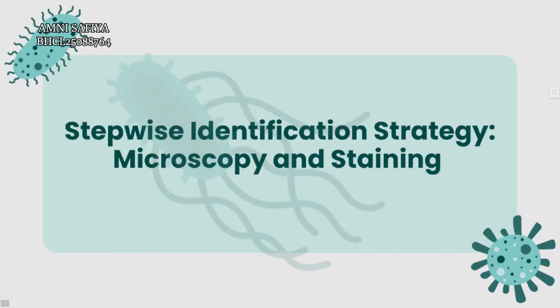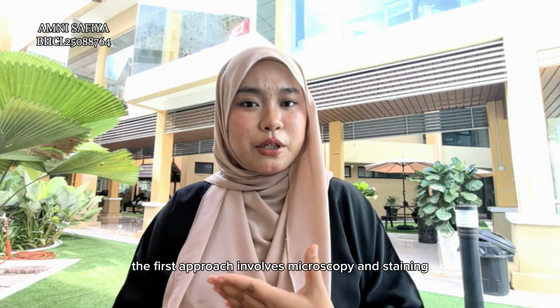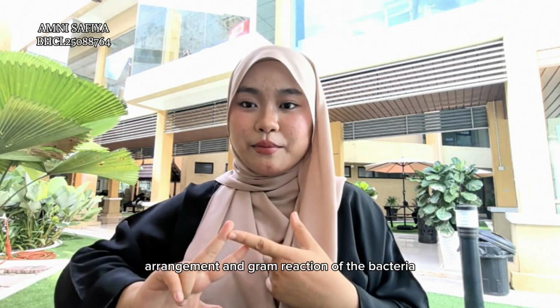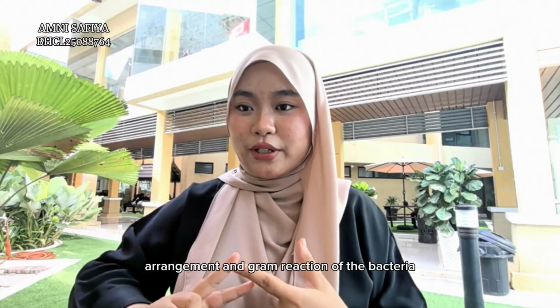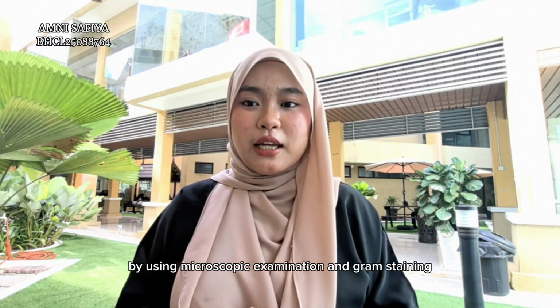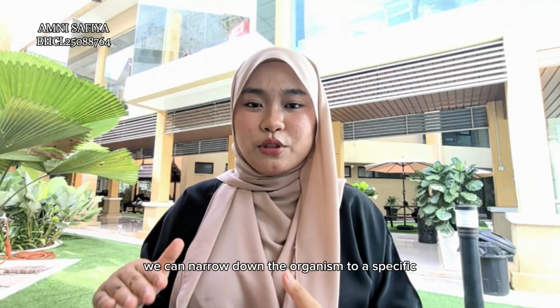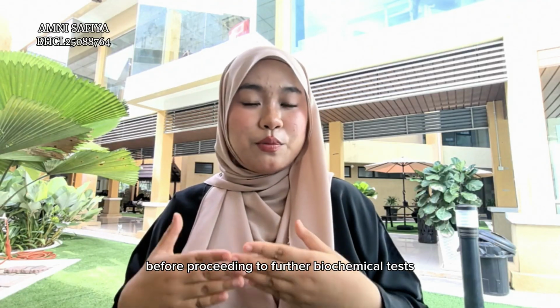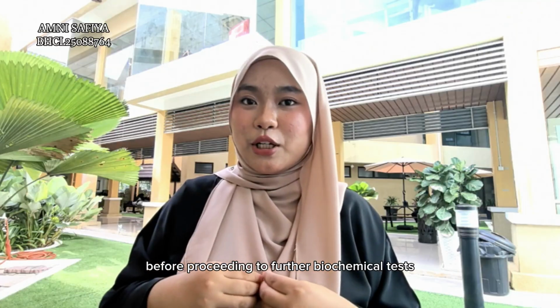For the stepwise identification of Staphylococcus species, the first approach involves microscopy and staining. This step allows us to observe the morphology, arrangement, and gram reaction of the bacteria. By using microscopic examination and gram staining, we can narrow down the organism to a specific bacterial genus, which is an important foundation before proceeding to further biochemical tests.